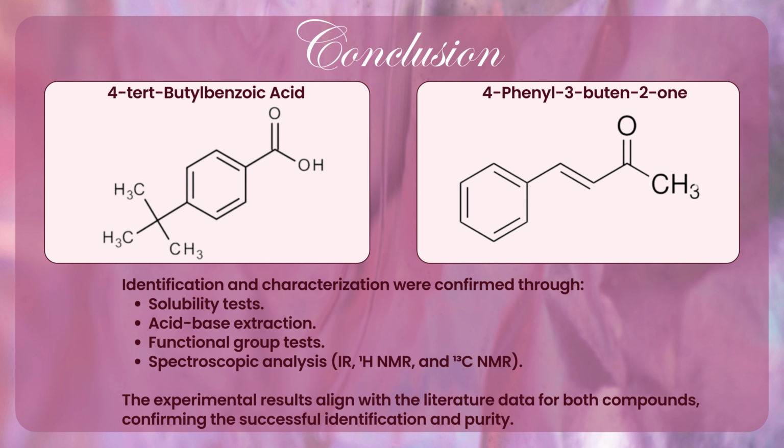And last but not least, I really enjoyed elucidating my unknown compound, especially assigning the proton and carbon signals using the spectrum results. For me, it is really interesting and requires high attention and of course a strong background in spectroscopic analysis. Not only are we focusing on one peak, but I also really need to go through each other peak to determine whether the proton has any electron-withdrawing group (EWG) or electron-donating group (EDG) that can influence the ppm of the other peak. And also I need to take care of the intensity of the peak, which provides a crucial observation for me to take note of during the identification.